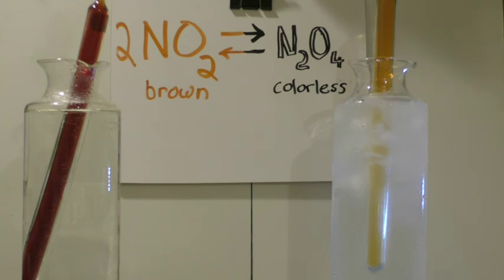So that's what we mean by a reversible reaction. We can push a reaction forward and backwards. The reaction hasn't stopped, it's still reacting, but the rates are the same. So to the outside world, it does not appear like there's any reaction occurring.